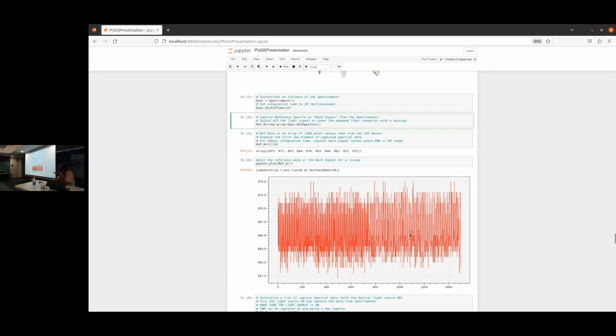In this case, you can see a digitized value available over here. This device goes from high to low, so you're seeing from a 10-bit A to D converter a value around 800, right? It varies within plus or minus 10, I think, or plus or minus 5, but that sets our dark current reference.